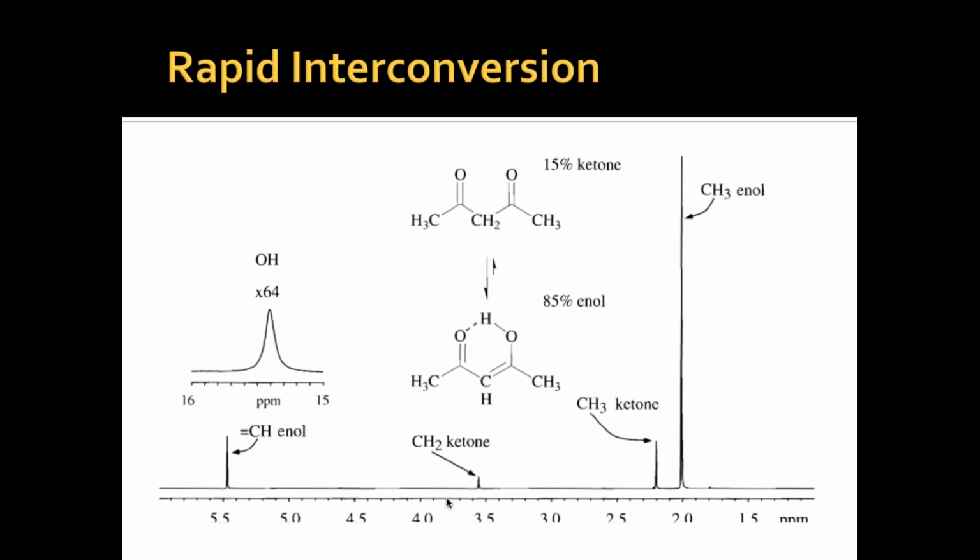So you have the mixture of both keto as well as the enol form in the same solution.